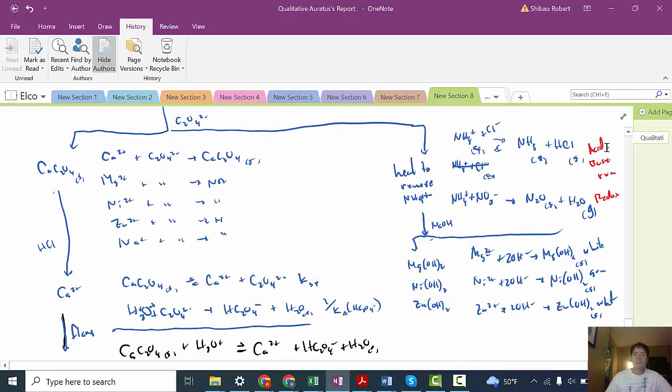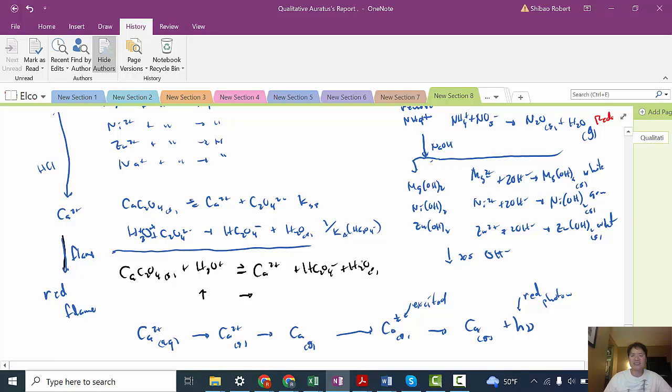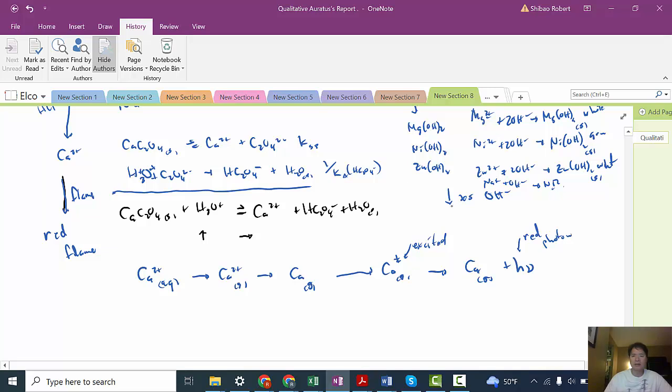And so what we're going to do is we're going to add excess hydroxide, sorry. So when we add excess hydroxide, this is what happens. Did I do the sodium? There's no reaction? No, I haven't. So over here, I'll do sodium plus hydroxide yields NR, no reaction. And that completes it. And so we have our excess hydroxide here. So let's go ahead and test each of these with excess hydroxide.